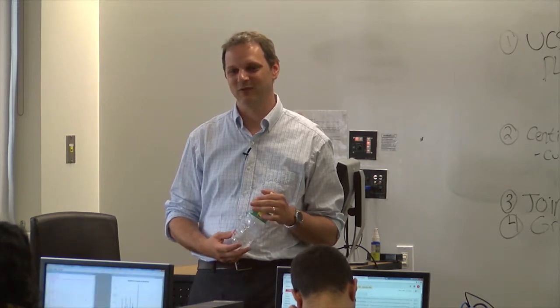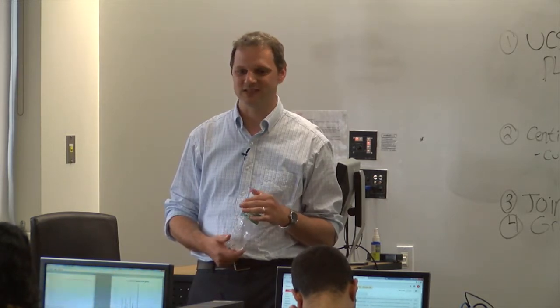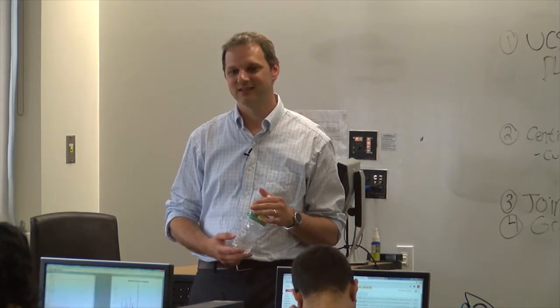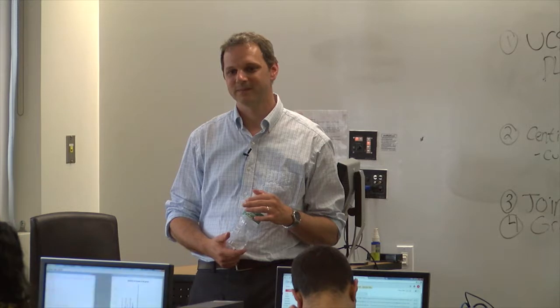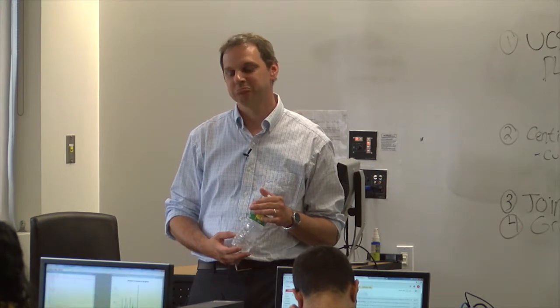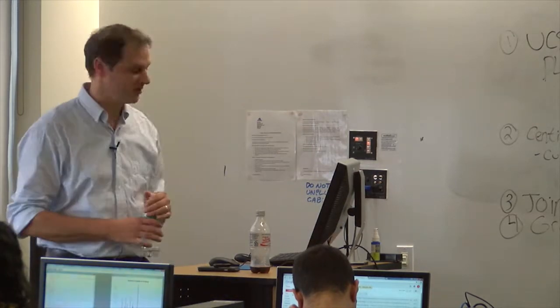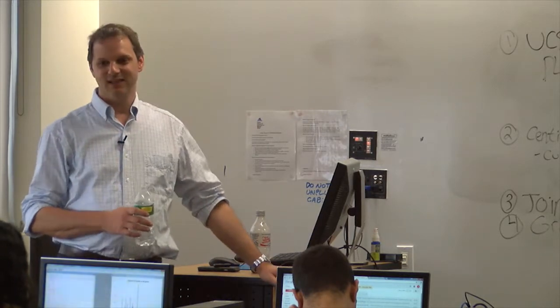But again, it's always decisions. What do you think is going to be the most appropriate data for you? How much do you trust it? I'm almost thinking if you were to take the JASPAR database and, using your Galaxy or your Genome Browser or whatever, cross-reference it with your ChIP-seq data, you may be able to start to get a hint of what transcription factor binding. Yeah, that's a reasonable data approach. You're cutting it down from a whole genome.